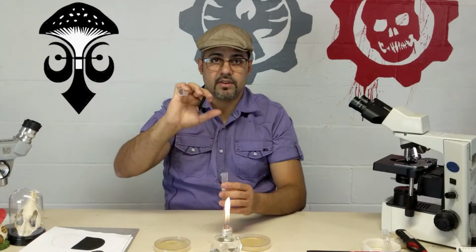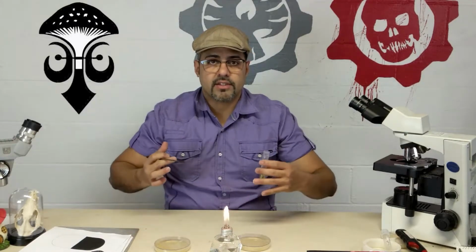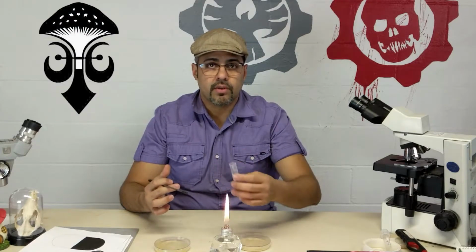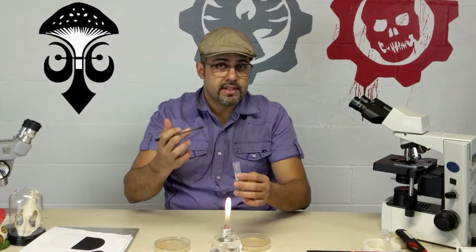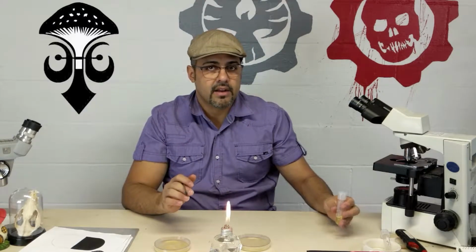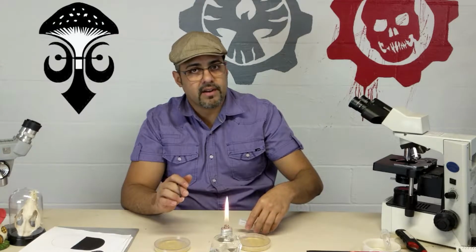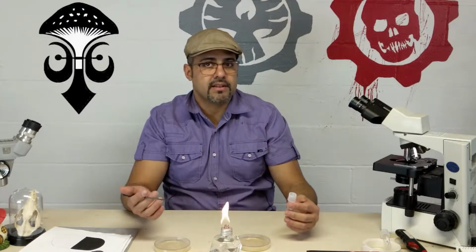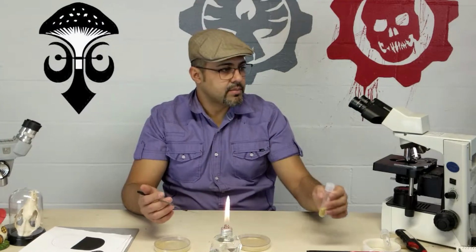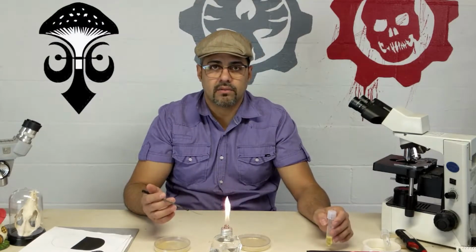The theory is you take it with your pinky, you always try to work close to the flame. You flame it 2 or 3 times, then when you finish doing what you're doing, you cap it again, and this goes to the rack. You cannot just leave your tube in there because it could be dangerous, because if you have a bacteria here, you can have a spill. So you always have to put it in the rack.